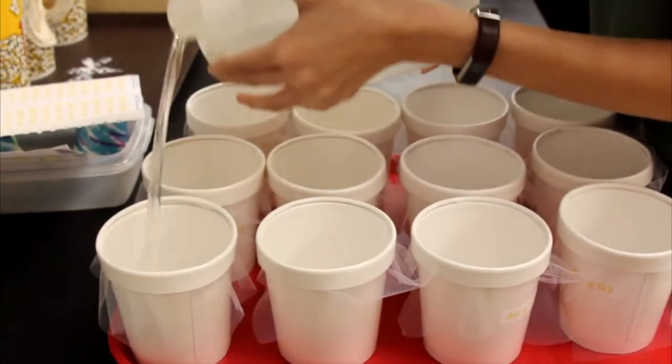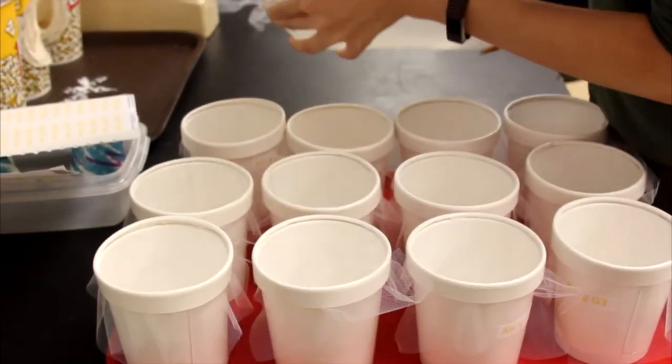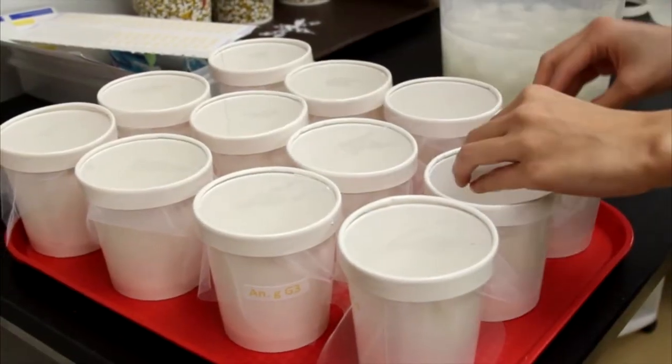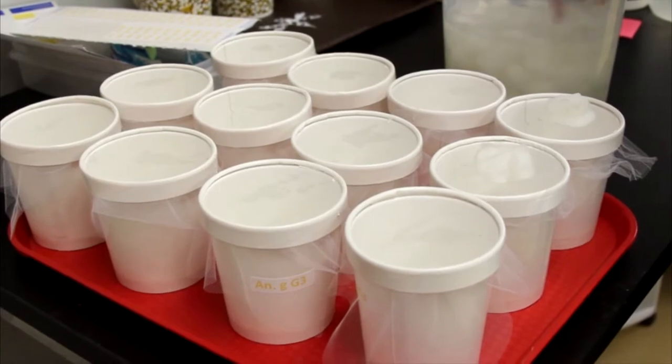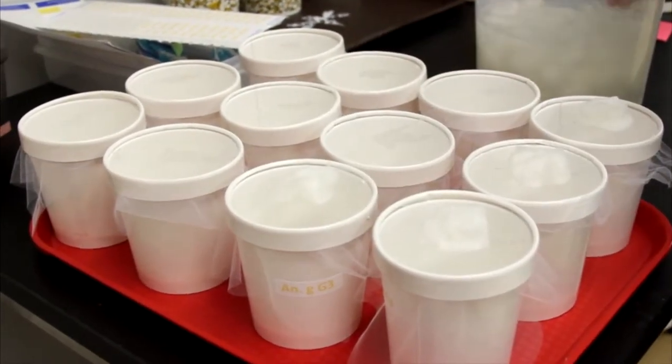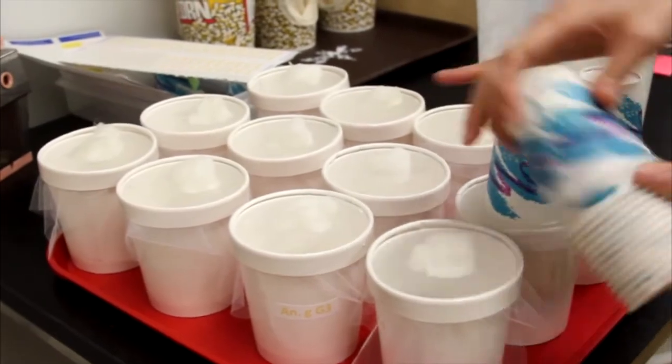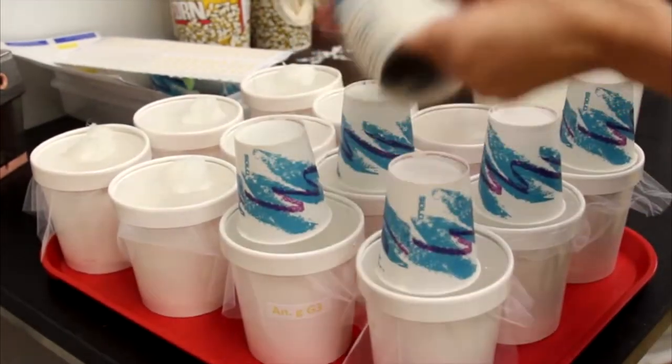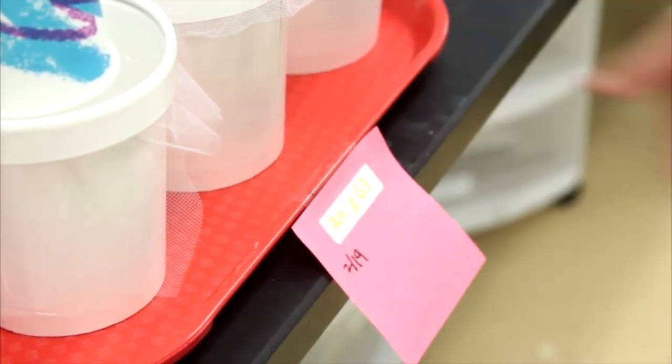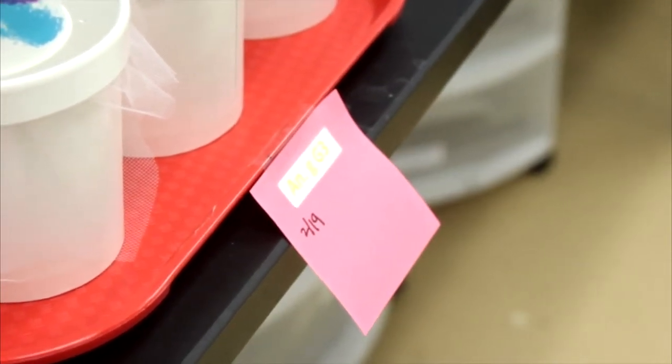Pour in half an inch of DI water. Place a damp cotton ball with a 0.3 molar sugar water solution on top and cover the cotton ball with a cup to prevent it from drying out. Add a label with the date on the tray. The water can be poured off after two days when all the mosquitoes have emerged.